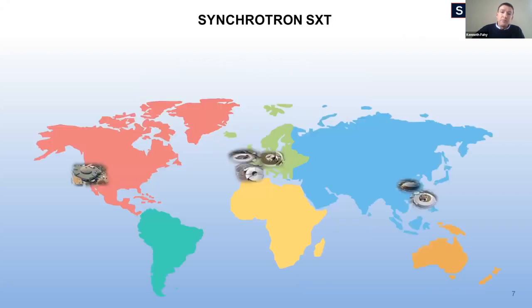So finally, just to put the availability of soft X-ray tomography currently into context, it's currently available at 6 synchrotron beamlines worldwide that are offering the soft X-ray imaging in the so-called water window. One of these is based in the US, there's 2 in Asia and 3 in Europe.